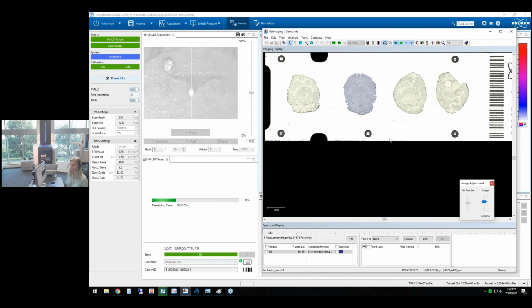Christina, you just talked about it. Of course, you didn't include it as part of the live demo, but can you speak to the advantages of TM Sprayer, why that is a preferred device? Yes, so TM Sprayer has multiple methods that can be used for different types of matrices. You can deposit different matrices for different classes of analytes. It has uniform matrix deposition.